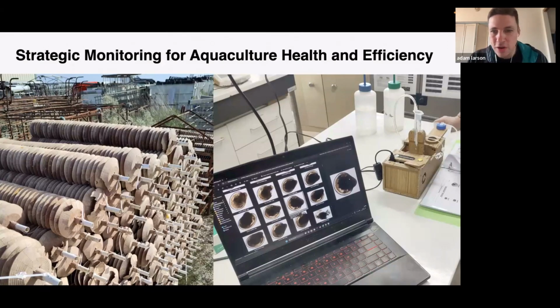And so with the PlanktonScope, what T was able to do is put this in the water and then see very accurately the different stages of these larvae.